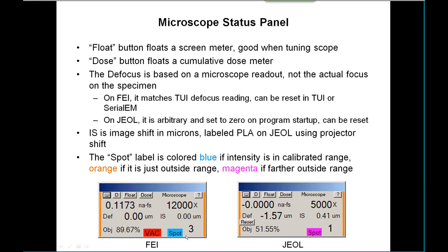On FEI we have a vacuum readout. We also have this spot label, which is colored to indicate whether the intensity is currently in the calibrated range for this spot size. Blue if it's calibrated, orange if it's just outside the range, and magenta when it's really outside the range.